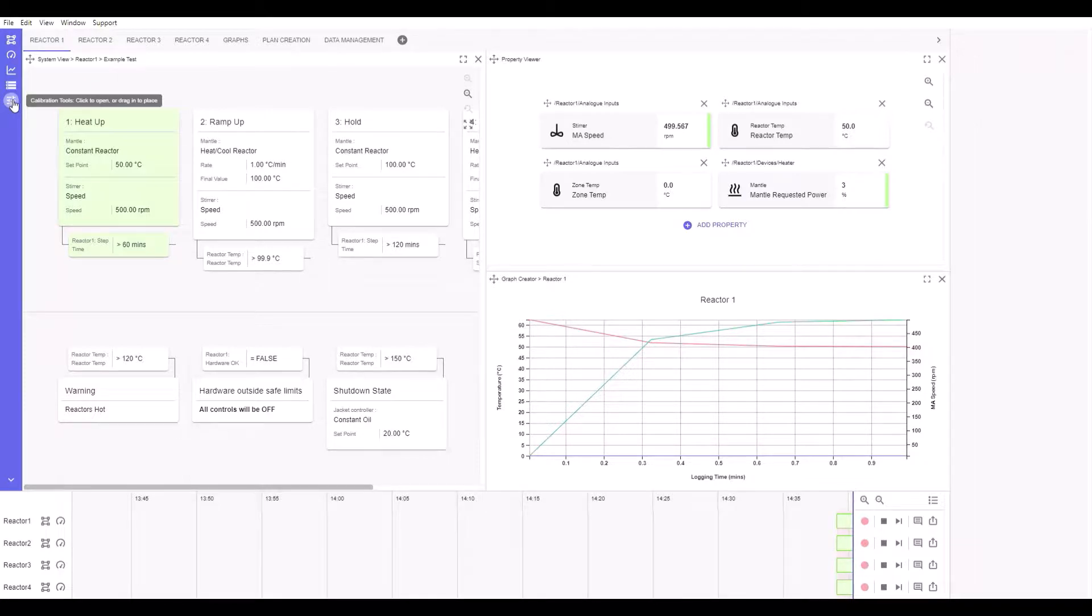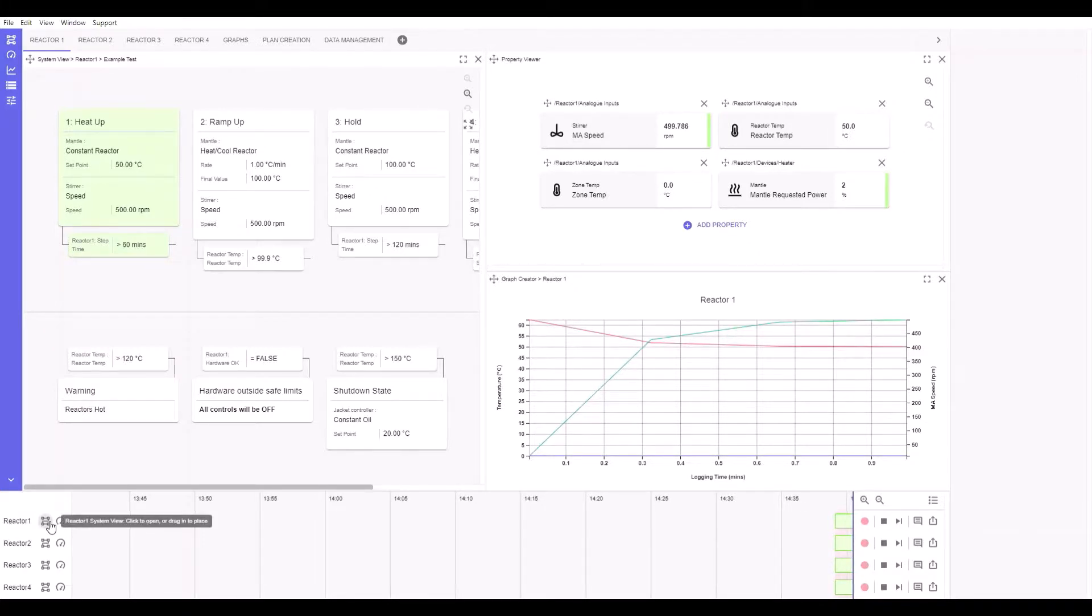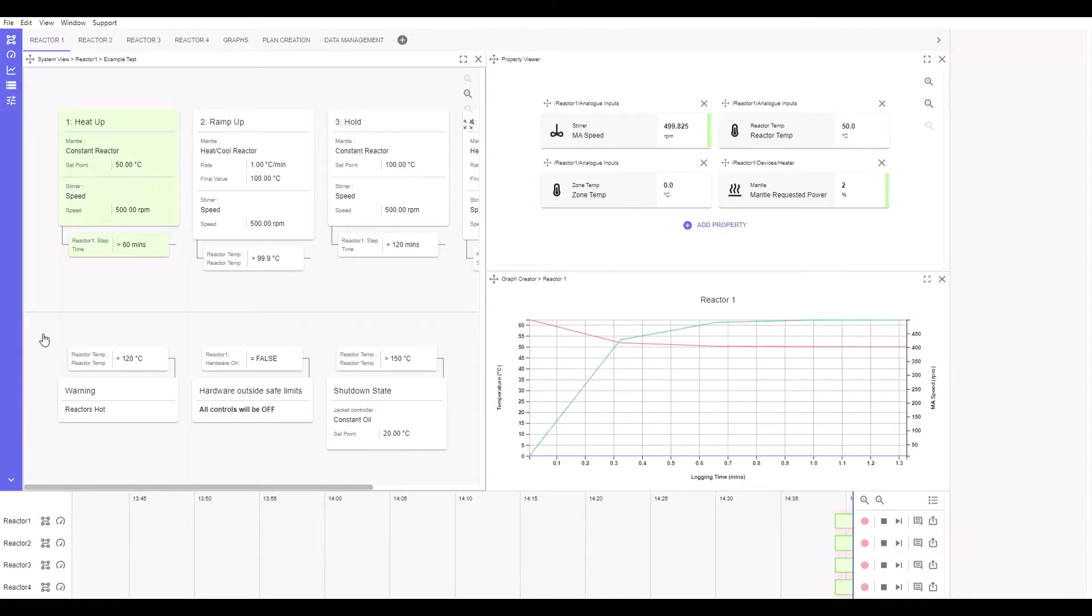Individual reactor system viewer and property viewer can also be loaded. More useful and impactful apps will be added over time, helping with the effortless automation that Lab Console provides.